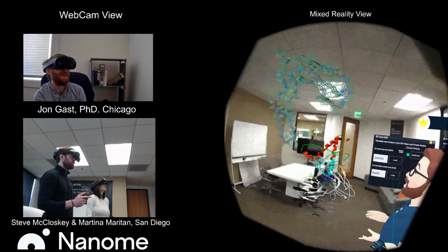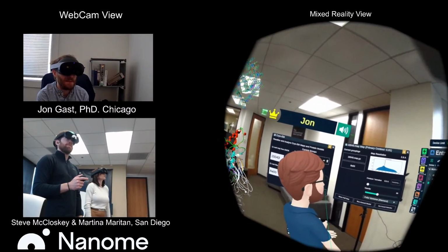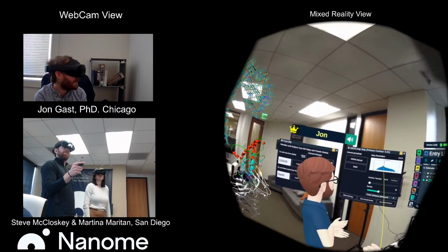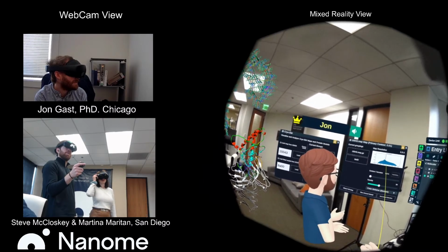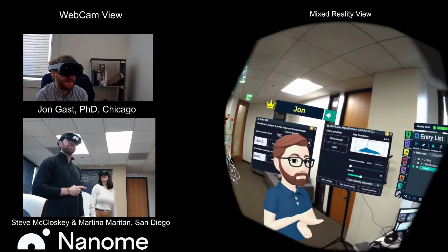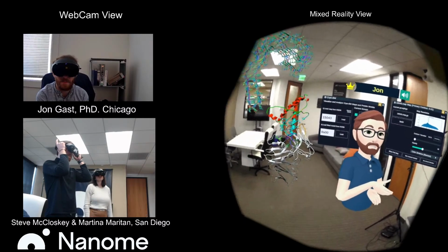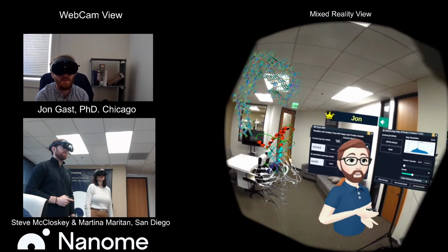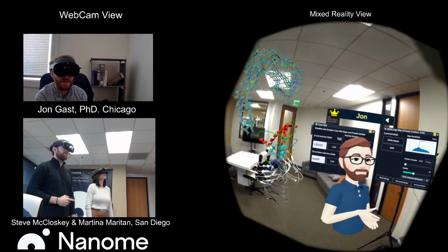If we want to take another question while we wait, that might work. But yeah, you could absolutely change the ISO value, and it follows a nice little histogram up top, so you could really see that data as well. It just takes a second to calculate. The initial load-in, essentially, if there's metadata associated with it, which there would be in EMDB, will naturally go to the ISO value that's designated there.